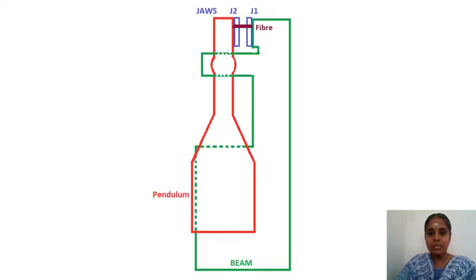So here the fiber bundle is placed. You cannot place it directly here. We have already seen the jaws are usually kept in the clamping vise, and the fibers are placed, locked, tightened, and the edges are cut using the knives, and only then it is placed here.